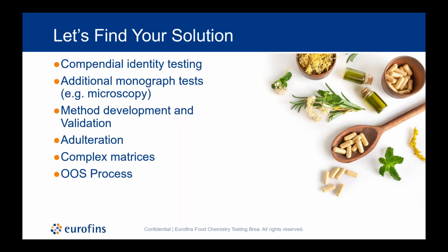So with that, some of those ways we can continue to help and support is beyond the compendial identity testing we've discussed today. There are additional monograph tests, for example, microscopy, that can be used in potentially an orthogonal way to really enhance the results of a single identity test.